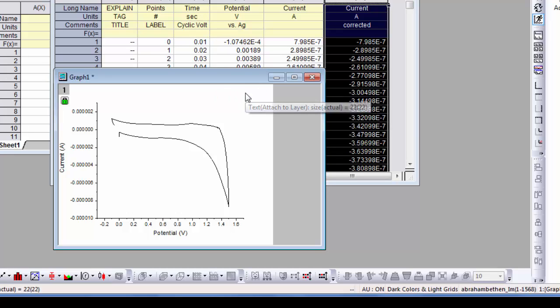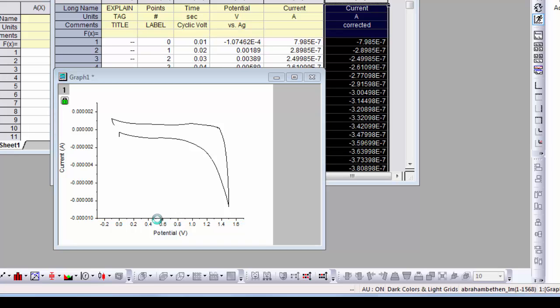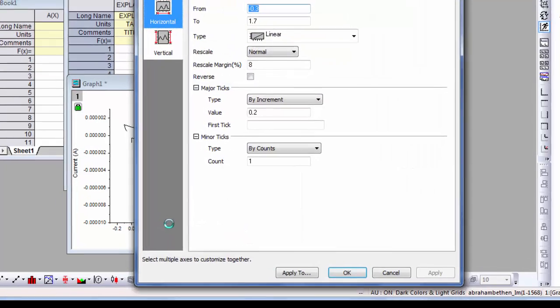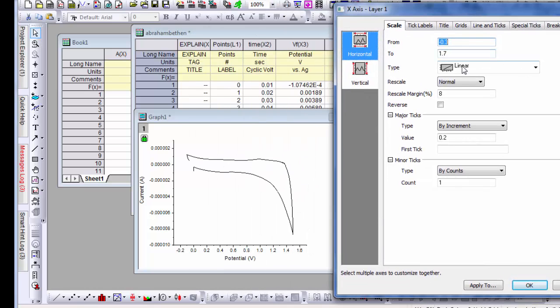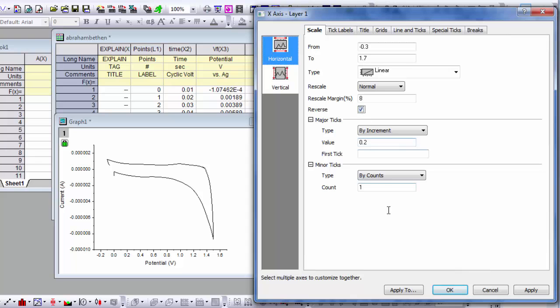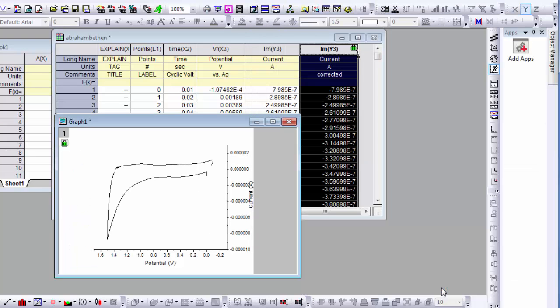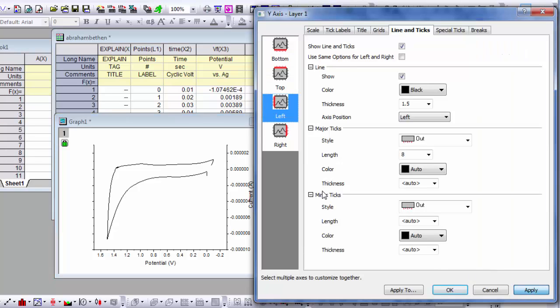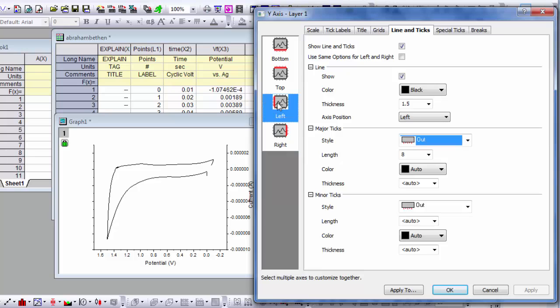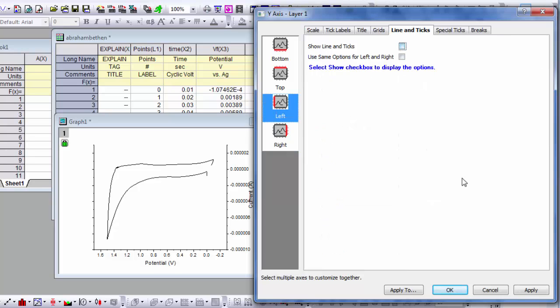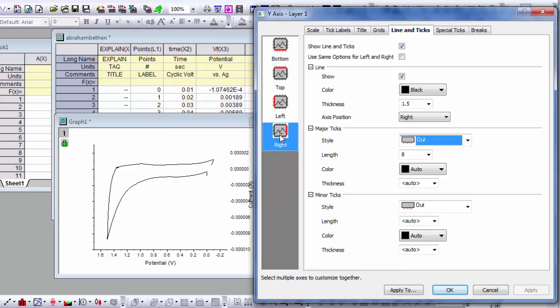Now we want to change the properties of the X axis. So we double click on the X axis and we can reverse it. Now that reversed our Y. So let's double click on our Y axis. Here it's on the right, here it's on the left. Since we have it reversed, I guess actually we're talking about the left one to turn on. That's confusing since we have it reversed. I'm actually editing the left one. So we want to show the ticks.